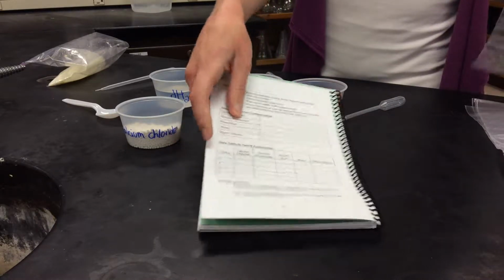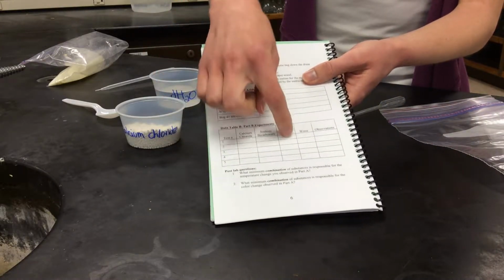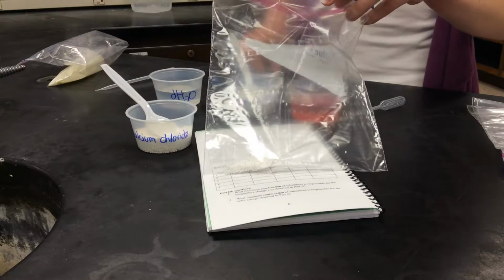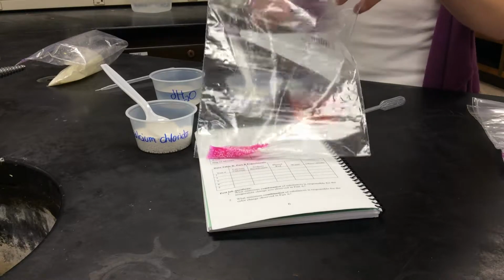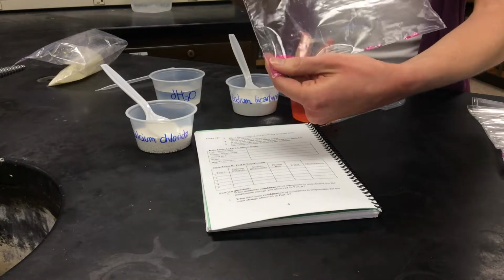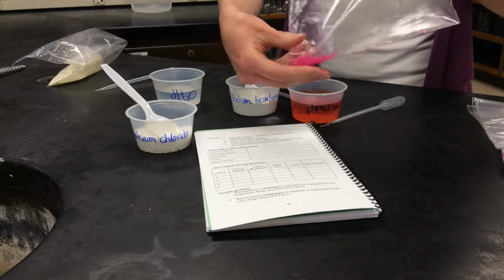So we're going to start with calcium chloride and phenol red. Okay, whenever we're adding phenol red, we're also adding water. So you need to check calcium chloride, phenol red, and water for this one. So check those 3 boxes, and then we'll see what happens. So there's calcium chloride. And here's the phenol red. Okay, and it's pink. If you were to feel this bag, it would feel very, very warm. Okay, there is definitely a temperature change happening. Okay, it's not turning yellow, but the bag is getting warm. So you want to write down that on the observations. Write down that the bag is getting warm.